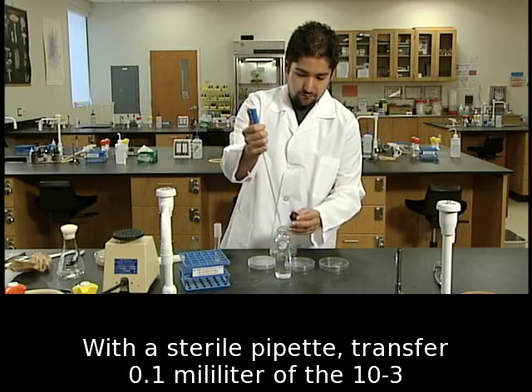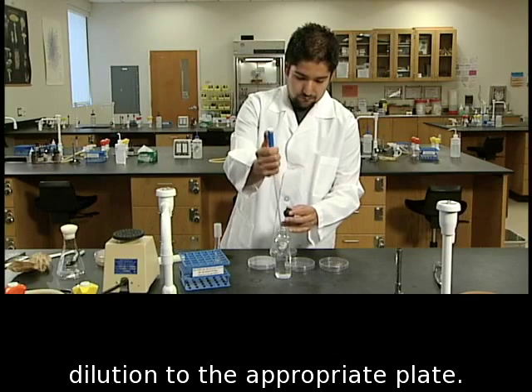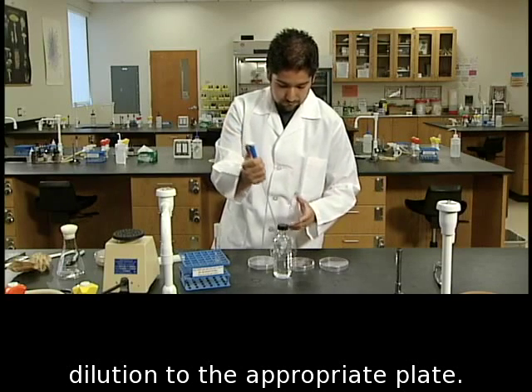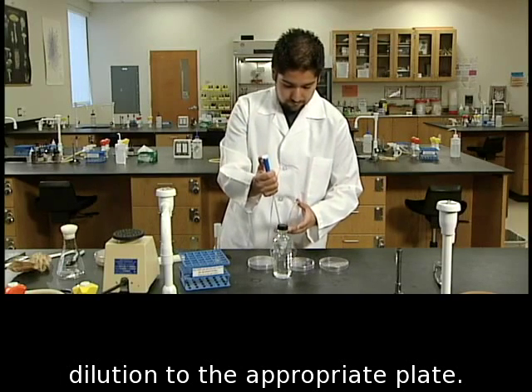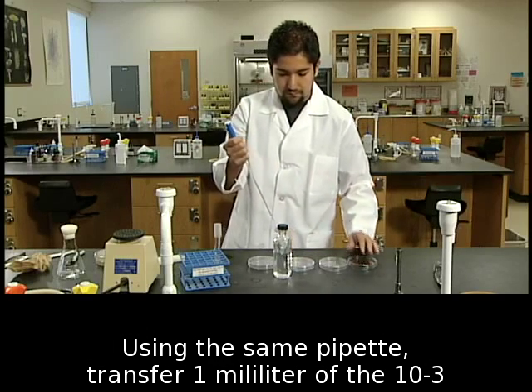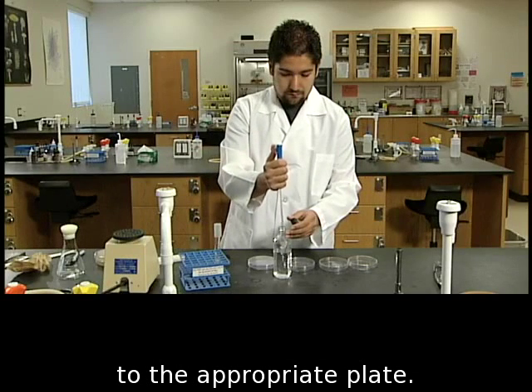With a sterile pipette, transfer 0.1 milliliter of the 10 to the negative 3 dilution to the appropriate plate. Using the same pipette, transfer 1 milliliter of the 10 to the negative 3 to the appropriate plate.